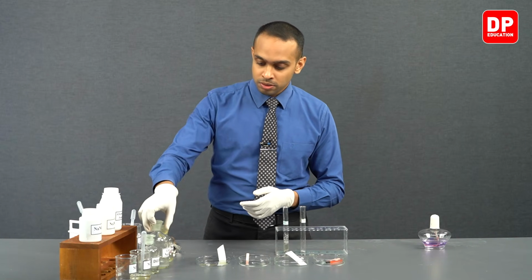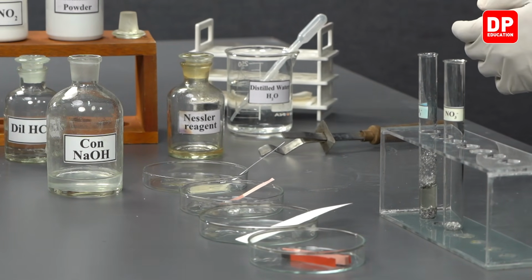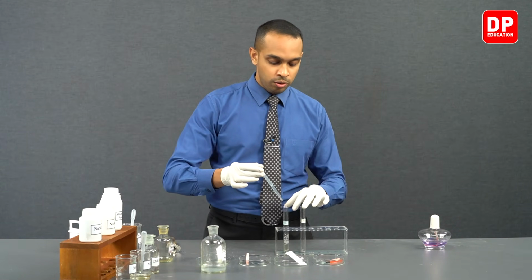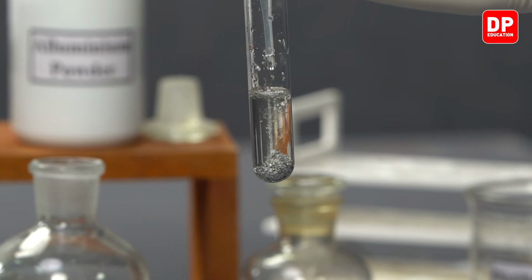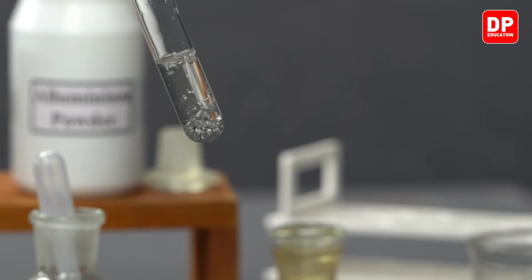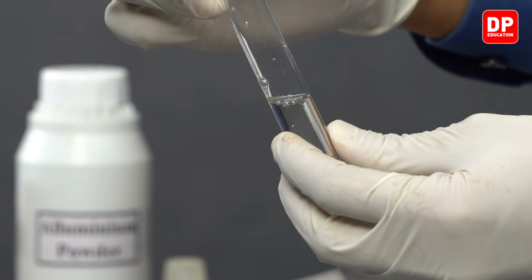So now let's take our concentrated sodium hydroxide solution we have here and add a few drops of, or we can add a little bit of sodium hydroxide to this, and when you mix it, after a while you will observe the formation of a gas here.